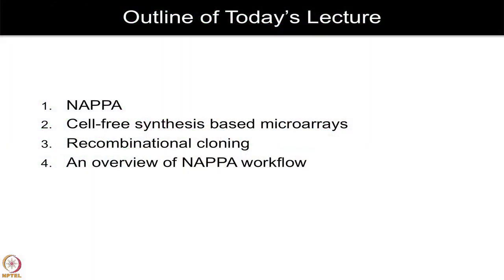Today in the outline of the lecture, I will first talk to you about NAPPA technology. I will again give you a brief concept and reminder of the cell-free expression based system. I will briefly touch upon another concept, which is recombinational cloning, and then I will give you a workflow of how to perform the experiment using NAPPA technology.